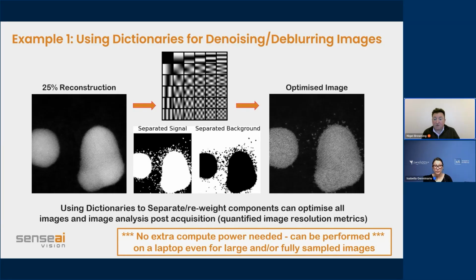And then the third thing that we can do is put physics guided information into that, because we know what the EELS edges should look like. We can put that information in. We can do DFT calculations and understand what the structures will do. We can make dictionaries from our simulations to help us interpret our acquired spectra. All of that means that you can get much higher signal to noise information out from much lower acquisitions on your EELS side of it. And that's something that we will implement in Sensei in the coming year. We expect to have it ready for M&M and for the IMC meeting coming up.